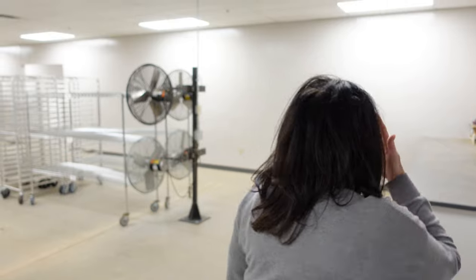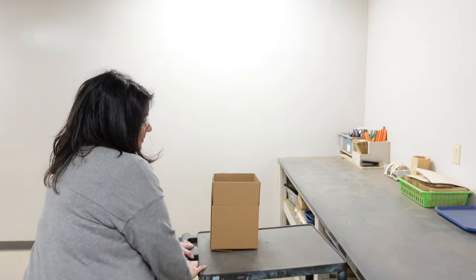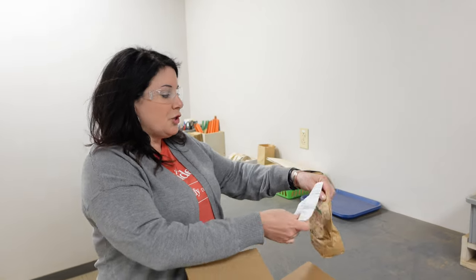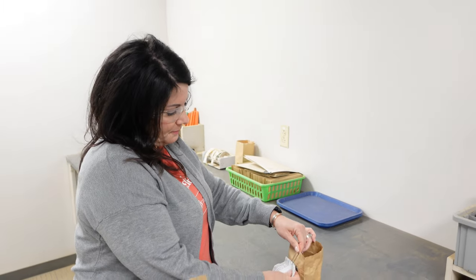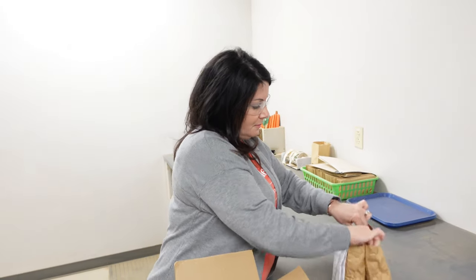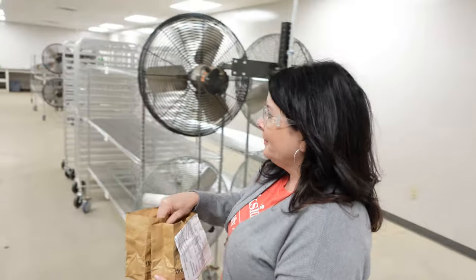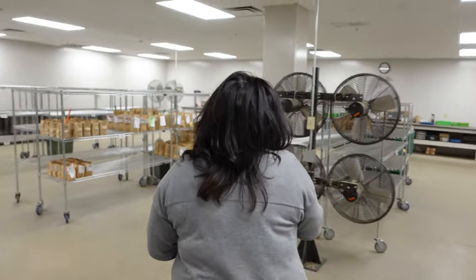Unpacking and drying. Correct. Samples will be dried in here because soil samples need to be dry prior to grinding. We open up the box, we look for our worksheet, we put the samples in the order that they're on the worksheet, and they're placed on our drying racks until they're deemed dry.